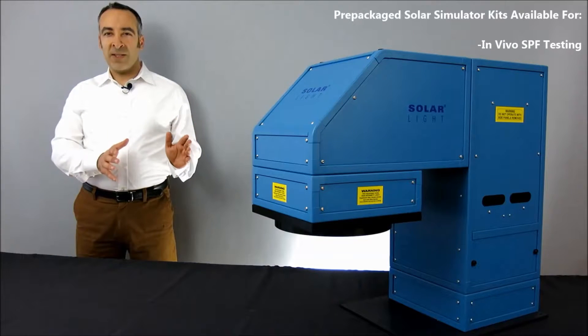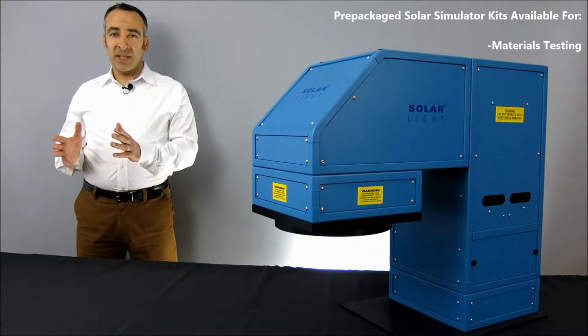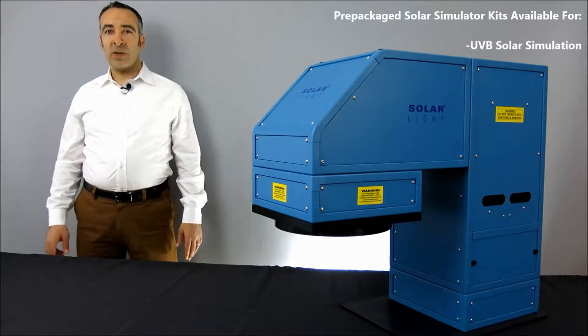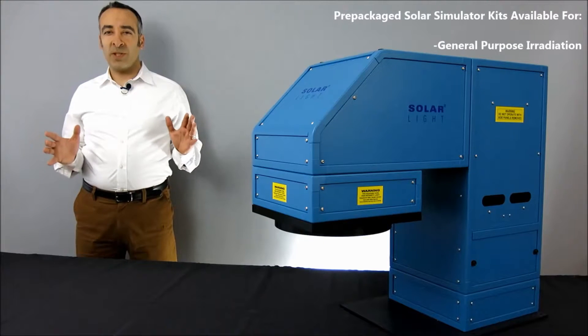These include in vivo SPF testing, photovoltaic cell testing, fade and color fastness testing, materials testing, photobiology research, FDA in vitro broad-spectrum sunscreen testing, UVB solar simulation, infrared testing, academic research, and just general purpose irradiation.